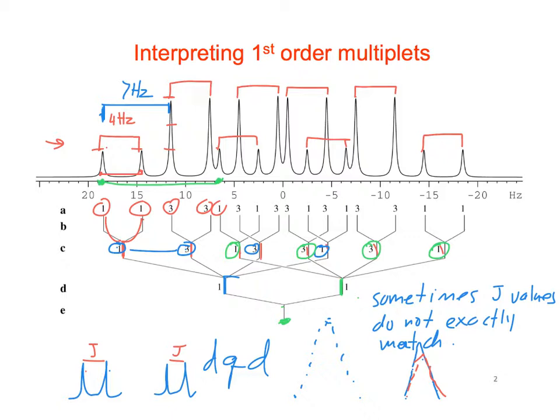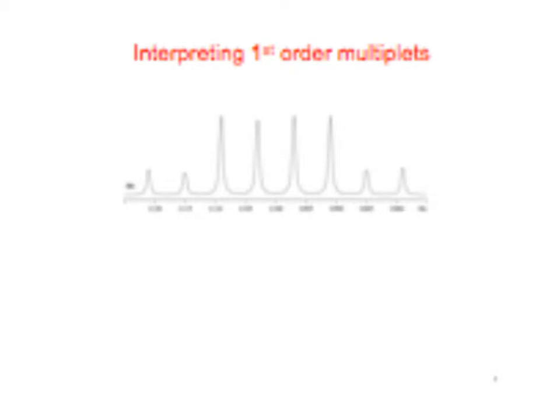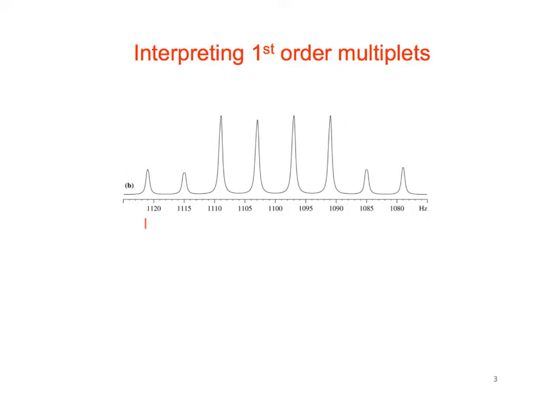All right, so let's look at another one already. Okay, so we're going to start at the outside, and we're going to just try to work our way across and estimate intensities. All right, so if we start with 1, next one's going to be 1. What do you think about the next one? Yeah, probably 3, right? 3, 3, 3, 1, 1.